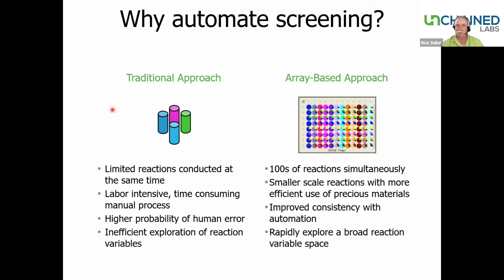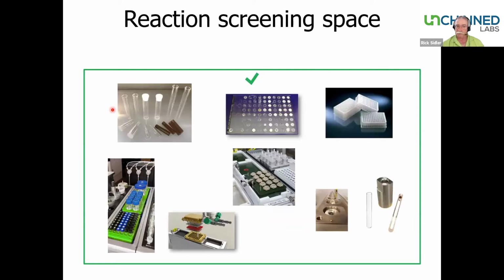So what type of reaction space are we talking about here for screening? We're talking about relatively small reactions, individual reaction tubes of less than a milliliter in scale in a high density like a 96-well array. We could be looking at plastic disposable plates for reactions, or high throughput experimentation in salt and polymorph screening. Quite often in reaction space, we'll be looking at pressure reactions. So we might be looking at a high density set of experiments for hydrogenations or carbonylation reactions. Or we might be talking about reactions run in our insert reactors in the OSR.